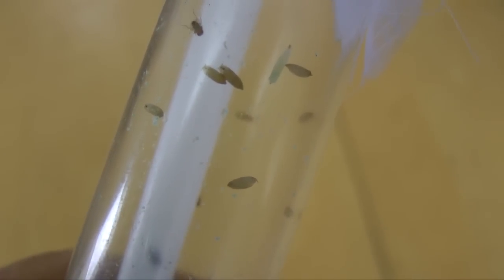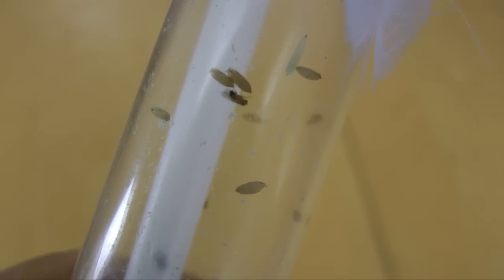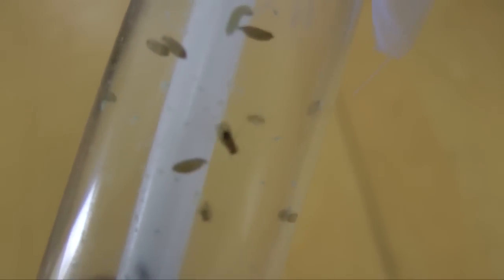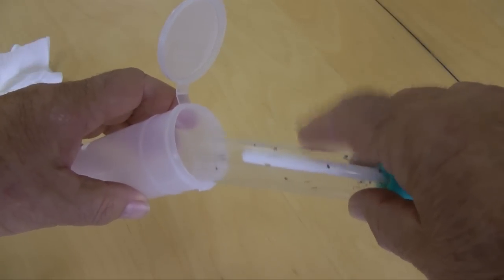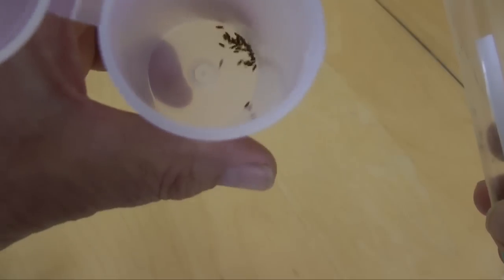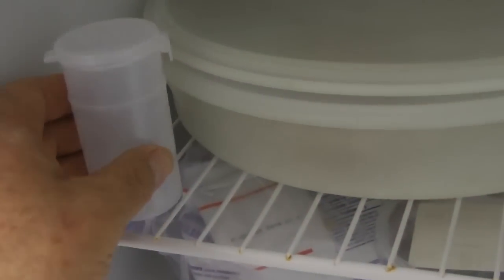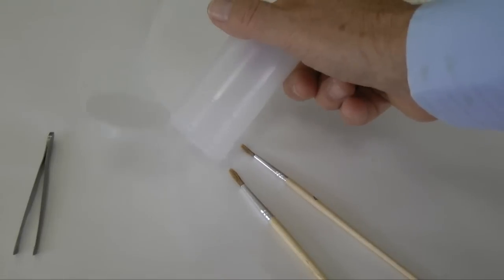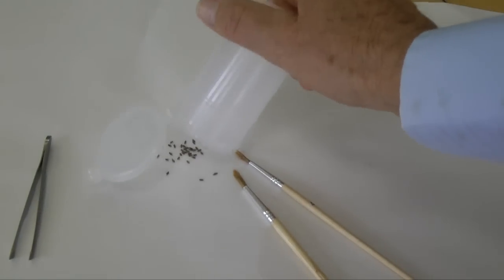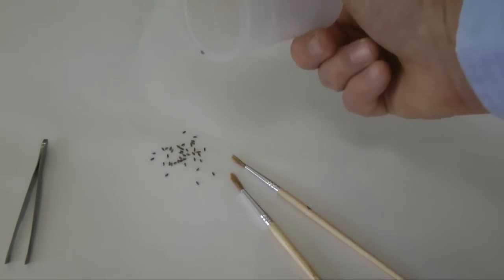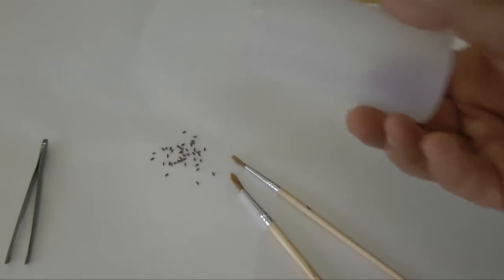When the first pupae appear, remove the parents to avoid mating with the emerging generation. Then, one week after the first adult flies appear, remove and freeze all the adult flies. Removing the flies a week after the first pupae appear, ensure that no second generation flies have matured. You should have lots of flies.